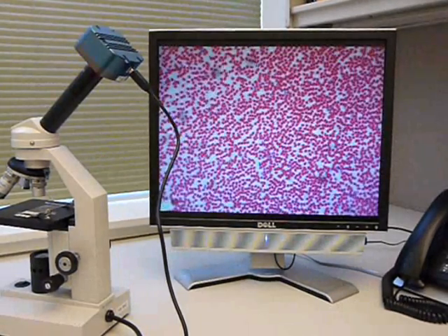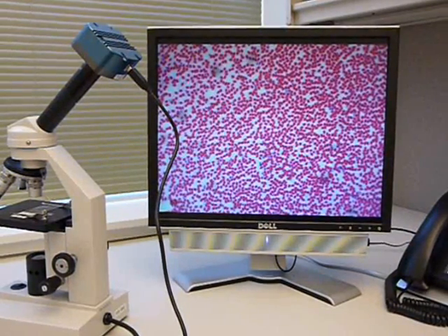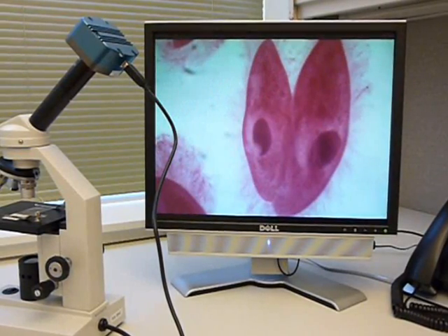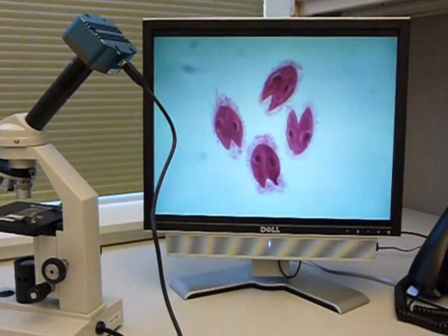Take your microscope study a step further with a high quality digital microscope camera. These cameras allow you to display microscope images on a computer monitor, project them on a classroom screen, or save them to your hard drive.